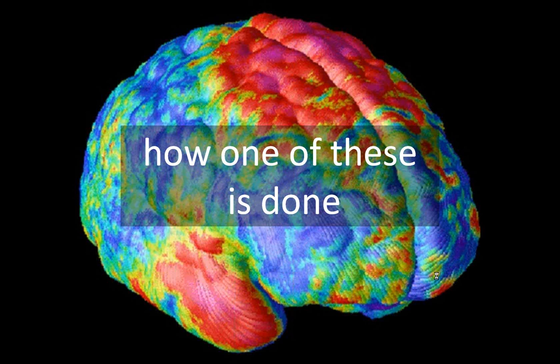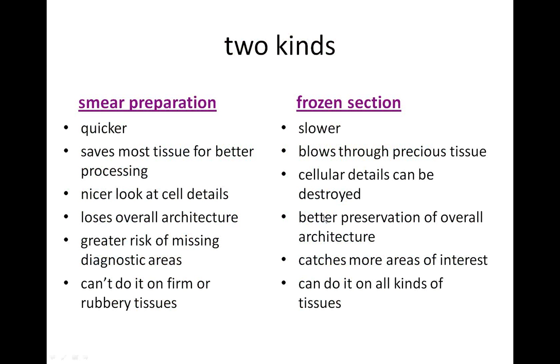All right, so here's how these things are done. There are two kinds of intraoperative preparations: the smear preparation and the frozen section. I'm going to click to a video here that is going to show a smear preparation. Now, there are a couple of caveats before we get started. First of all, as you can see, there's a little bit of blood. It's not that gory, but just be warned.